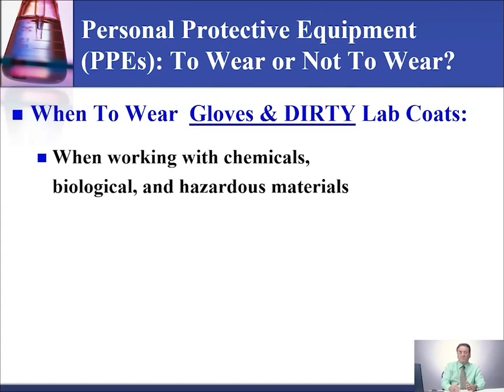A clean lab coat is used outside of the bench, outside of the laboratory, in a clean area, like going to meetings, the cafeteria, or clean offices. You don't have to have a clean lab coat. You could go out with your street clothes, but if you want a lab coat to wear outside of the lab, it has to be a clean lab coat that is not used on the bench.